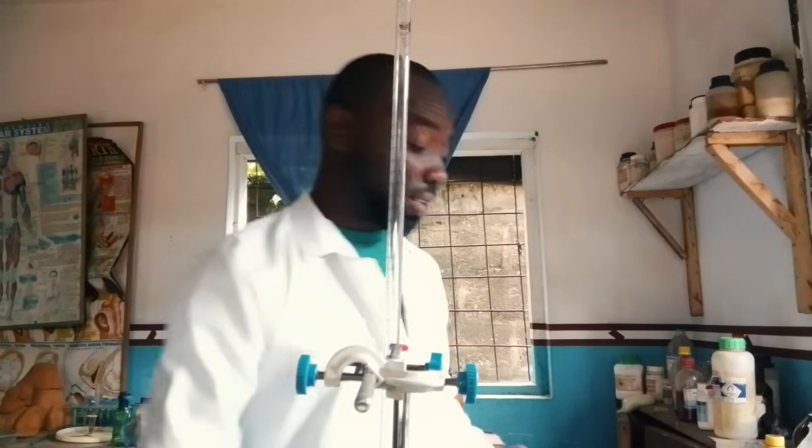As you can see, I have already rinsed it with the acetic acid. Remember what I told you? These chemicals or solutions will be prepared and kept on your table on the day of your exam. So once you enter the exam hall, you will meet your solutions. Now the next thing is for you to follow the instruction and add the chemicals wherever you are asked to add them.